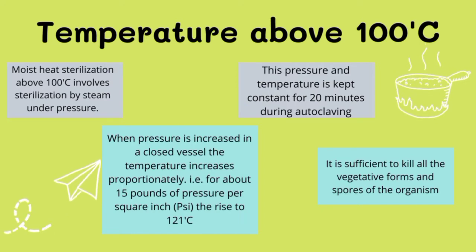Boiling is a process that does not ensure complete sterility, but it is enough for the removal of pathogenic vegetative microbes and spores. It is most effective when boiled for 20 minutes. It will kill most of the pathogenic organisms, particularly viruses and bacteria. Tyndallization is a method used for sterilization of media with sugar and gelatin at 100 degrees Celsius for 30 minutes on 3 successive days. This is to preserve sugar which might be decomposed at a higher temperature.